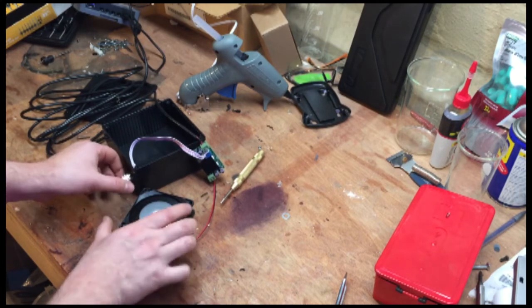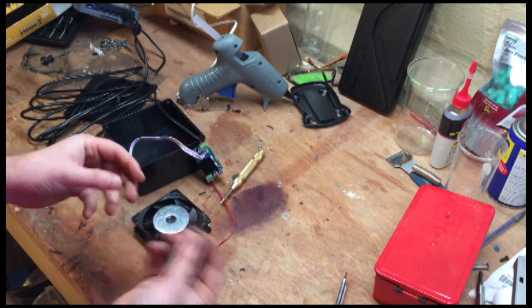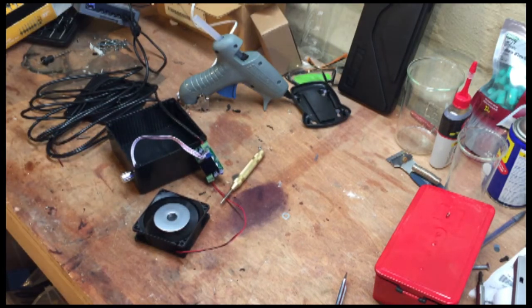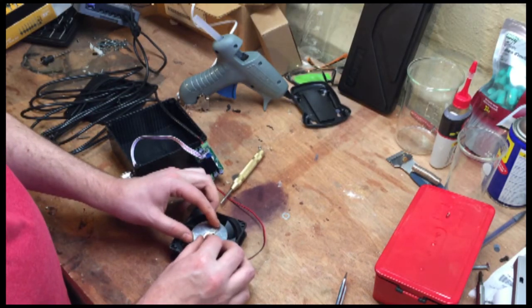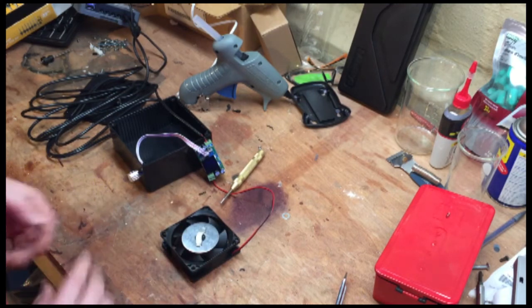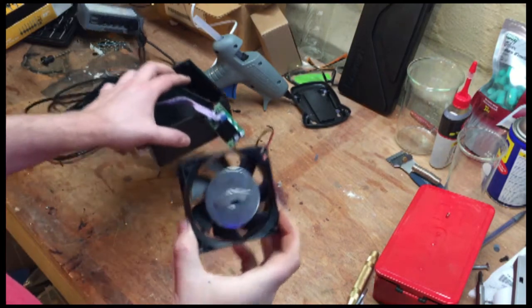And you can see that I have it a little bit off balance, otherwise it wouldn't be shaking like that. But let's just take it down, turn it off. I'm going to put on our magnet. Put it about where I think is balanced. And if we turn it on, not so good. Try it again. All right, that's pretty good right there. I think I'm going to try to fine tune a little bit better. All right, so that looks pretty good to me right there.